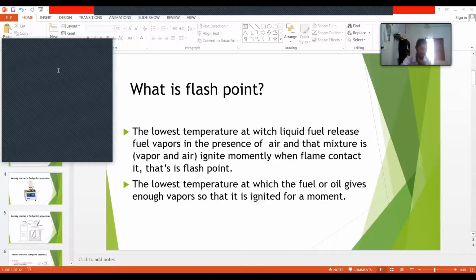Okay, good. 027. Yes, sir. Yeah, then what is the fire point we found? 96. Is it 96? We found it as.